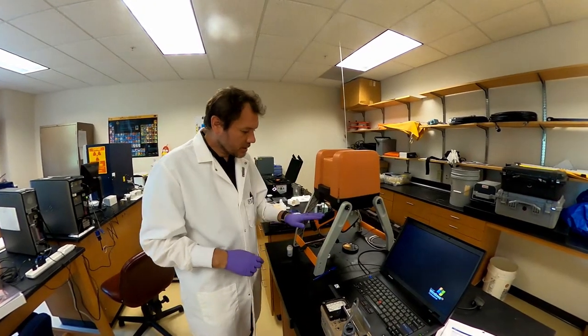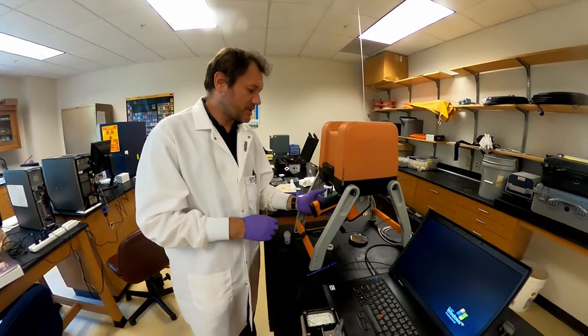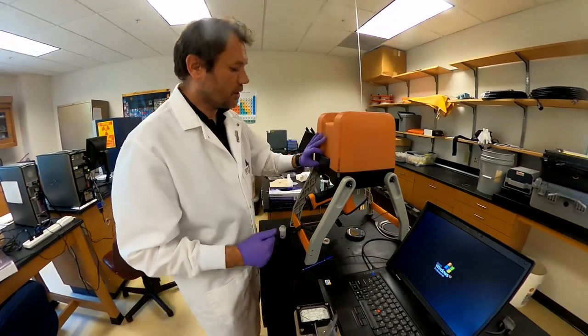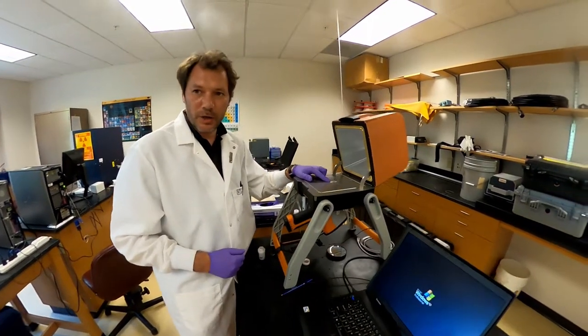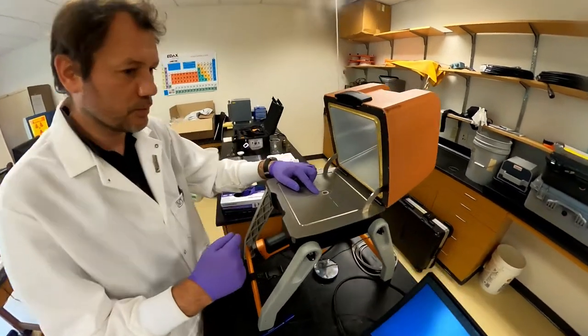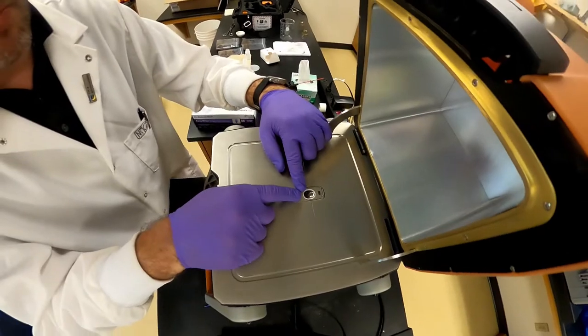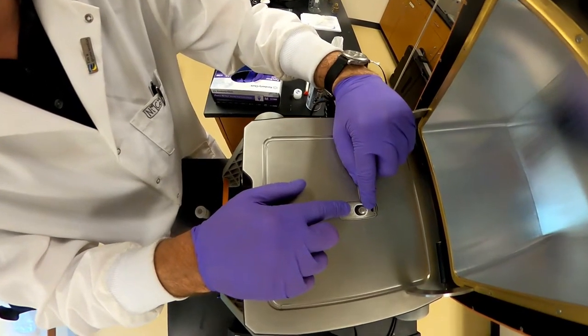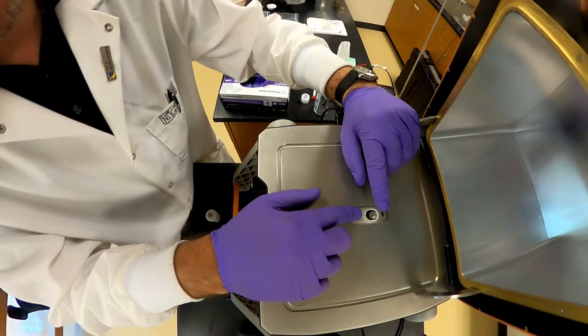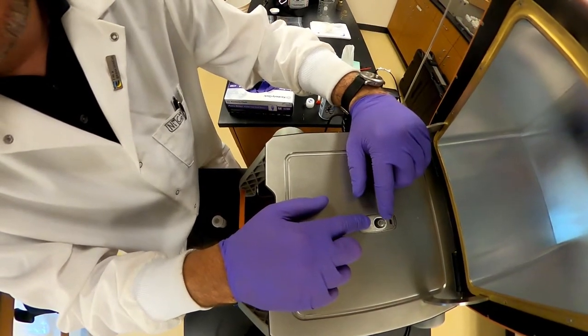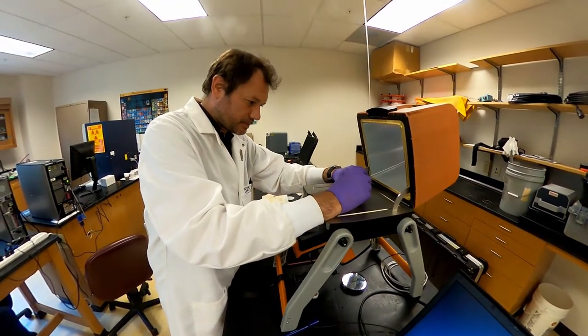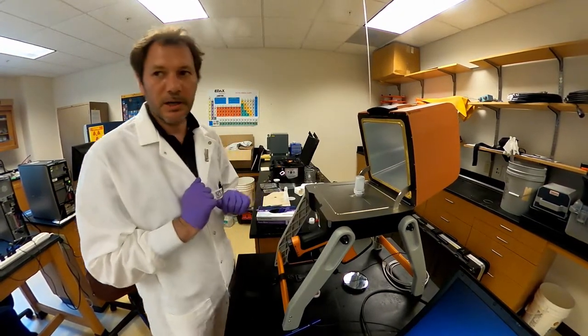So now let's move on to the X-ray instrument itself. So this X-ray gun is generating X-ray because there is an X-ray source there. There's a battery, an X-ray source, and it's connected to a computer, but you can disconnect it too. We put the sample in front of the gun and there is one part of this opening there that will project the X-ray and this part here on top is the detector. So basically, it will excite the sample and whatever is emitted by the sample will bounce back into this detector.